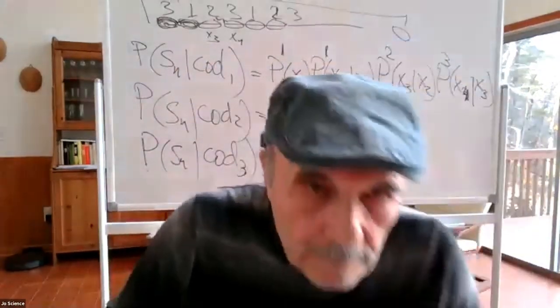So usually repetitive sequence is not influencing parameter estimation. You may be safe on that side, that you don't have to mask it. But again, if you want to mask, you have this option. You can put all the letters in uppercase, and you can soft mask and put repeats into lowercase and tell the program, please use soft masking. Then in regions with masked repetitive sequence, there will be no prediction.